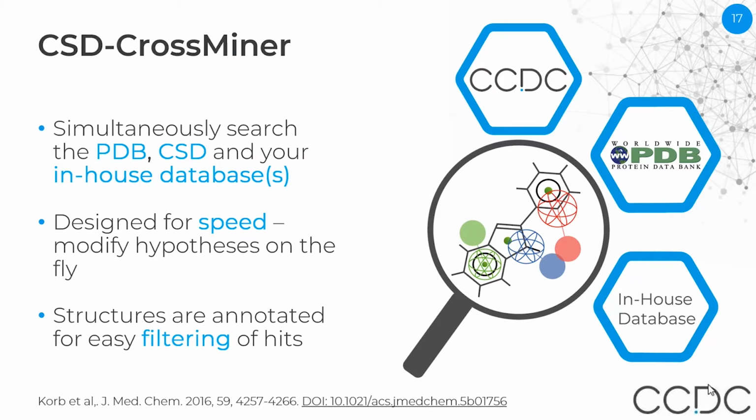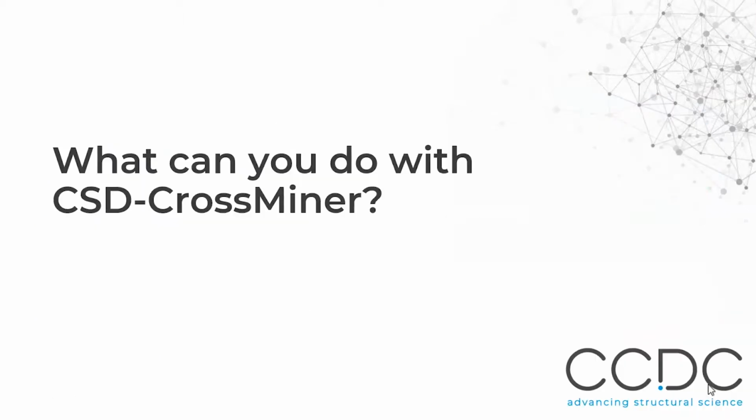So the entries in the databases are annotated with information related to the crystallographic structure. For example, for CSD, you will see the ref code that Suze described before, while for PDB structures, you can have information about the EC numbers or the PDB molecular resolution and many more. This annotation can be used not only to retrieve information about the structure, but also to filter your results, for example, to retrieve only specific types of structure that match your Pharmacophore query.